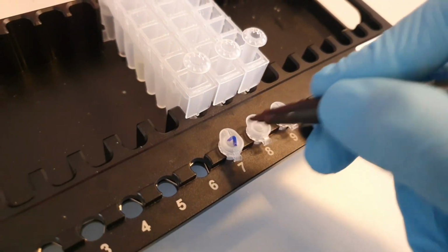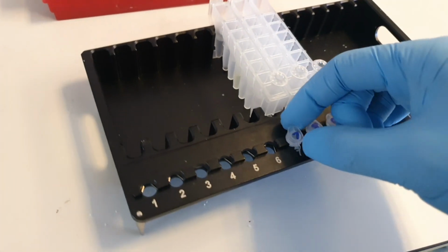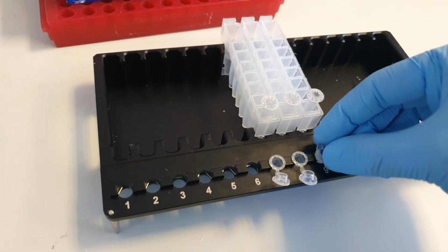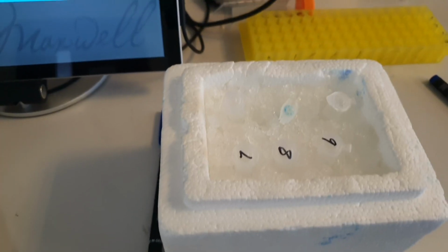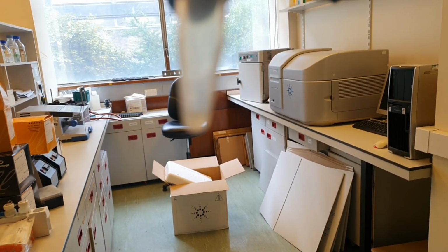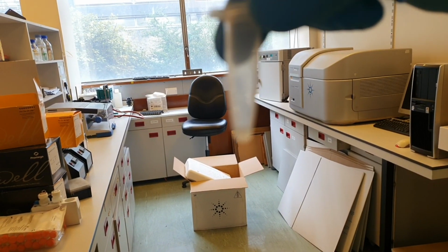We can label the tubes and make sure these are open. Okay, so next we have to prepare our samples. This is one of the samples. It's just the cells with the supernatant removed.